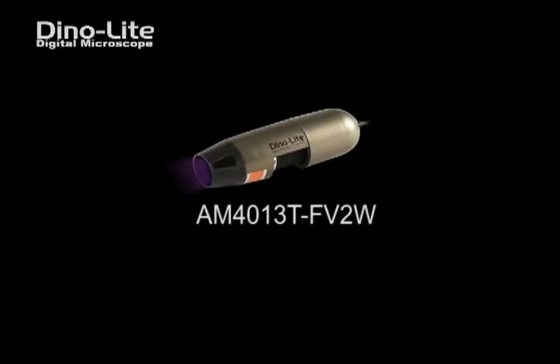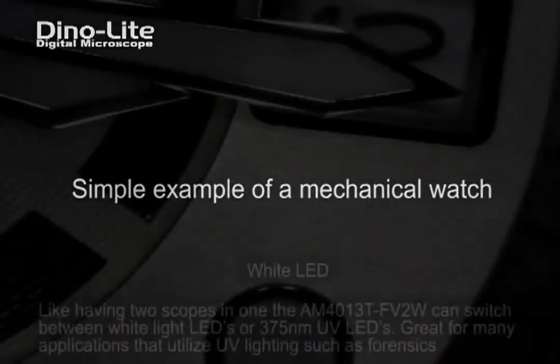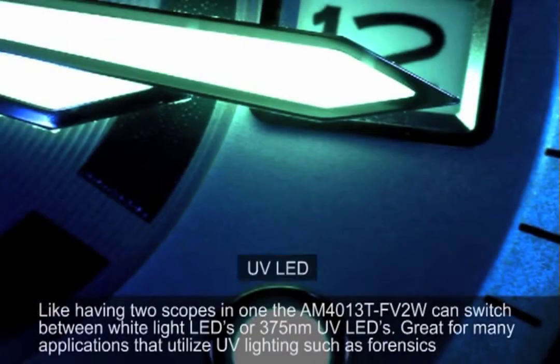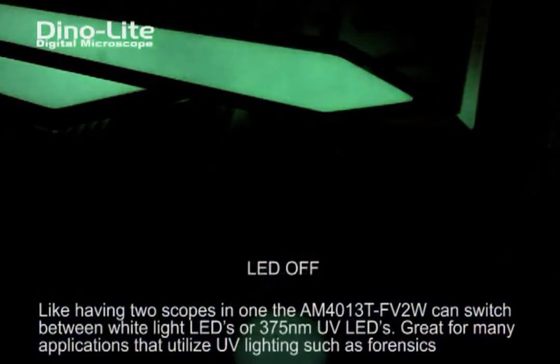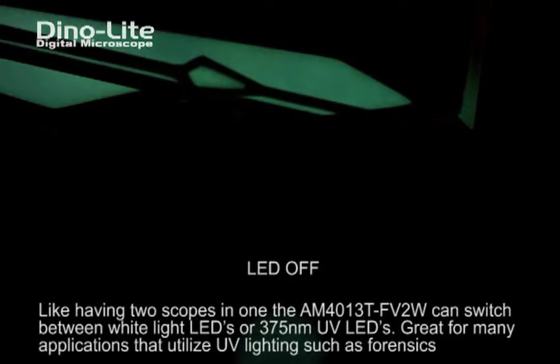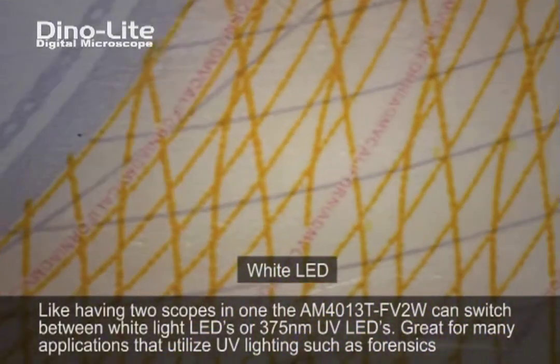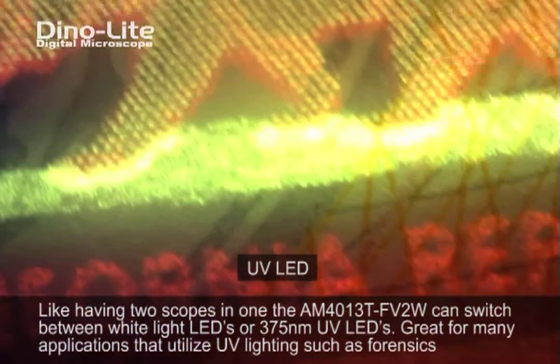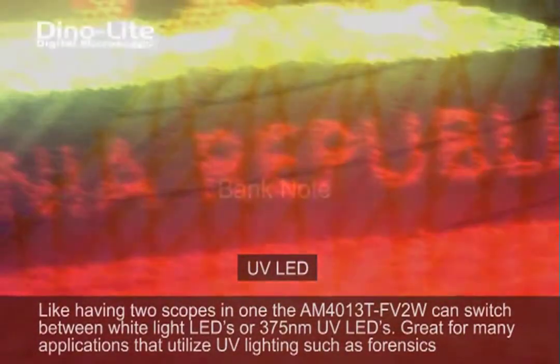Introducing the AM4013T FV2W. This unique model of handheld digital microscope has a built-in four white LEDs as well as four near ultraviolet LEDs emitting a 375 nanometer wavelength. This model features frame rate speeds of up to 30 frames per second, a 1.3 megapixel camera, as well as magnification powers going from 10 to 220 times. The FV2W also has a recalibratable measurement feature.